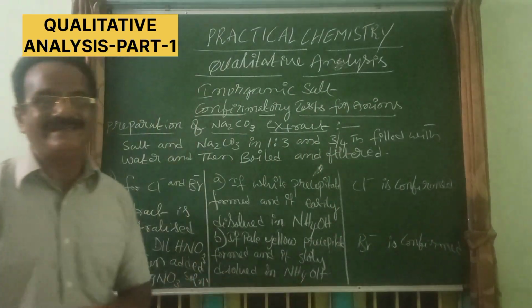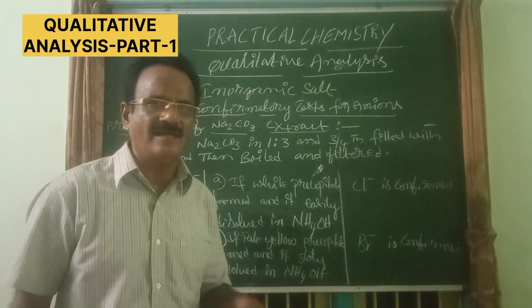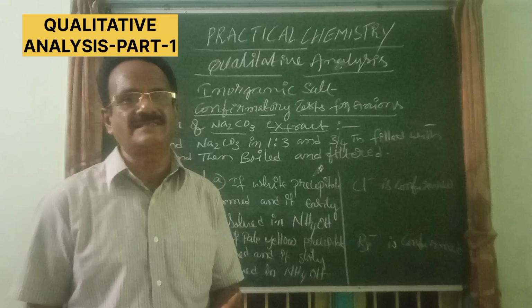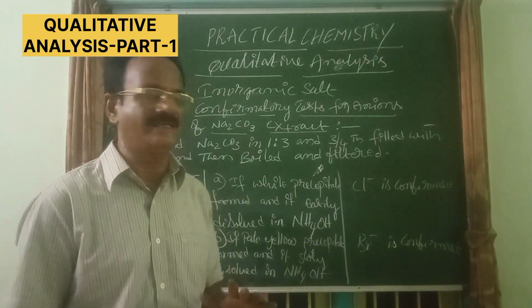Okay, two observations need not be considered. For the ion which is present or identified in the identification test or dry test, only the confirmation test is to be done. Is it clear?